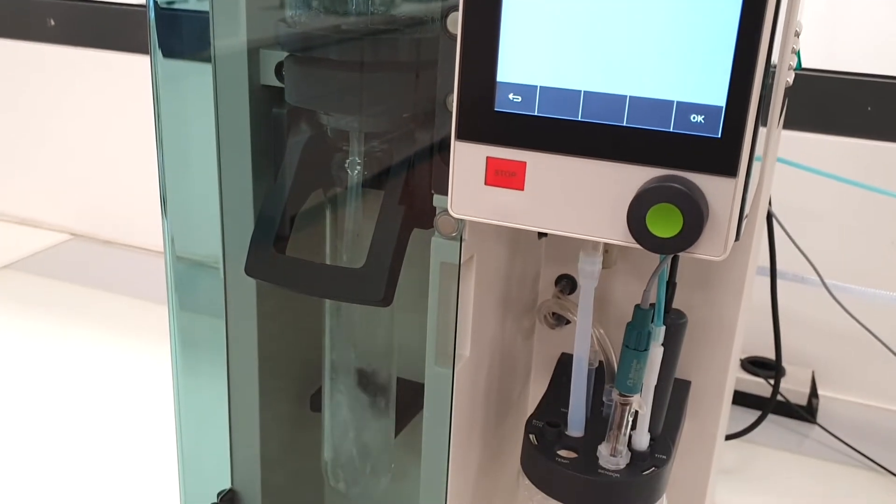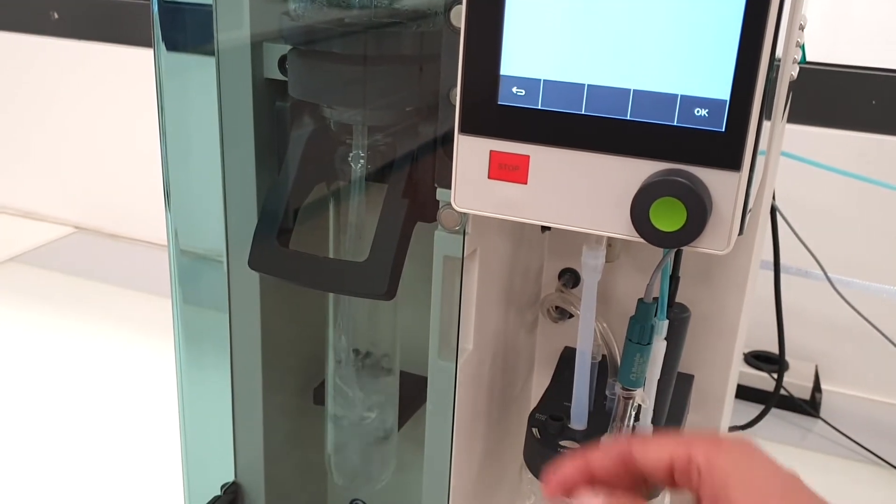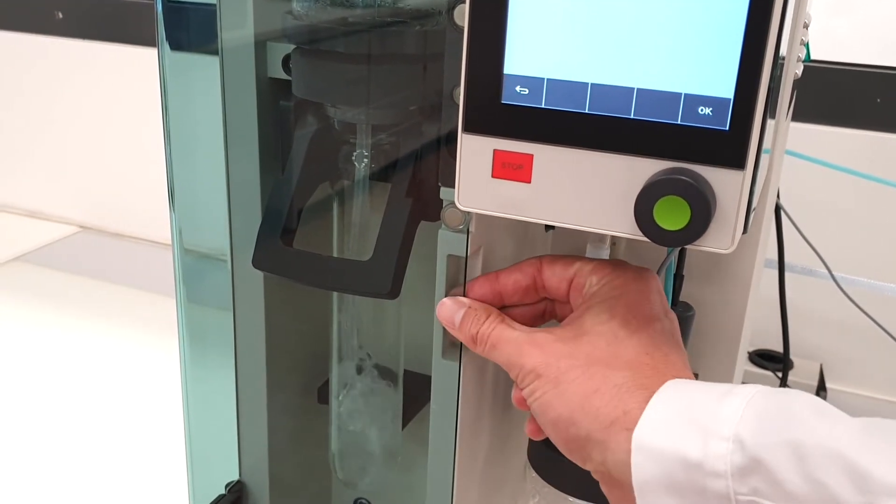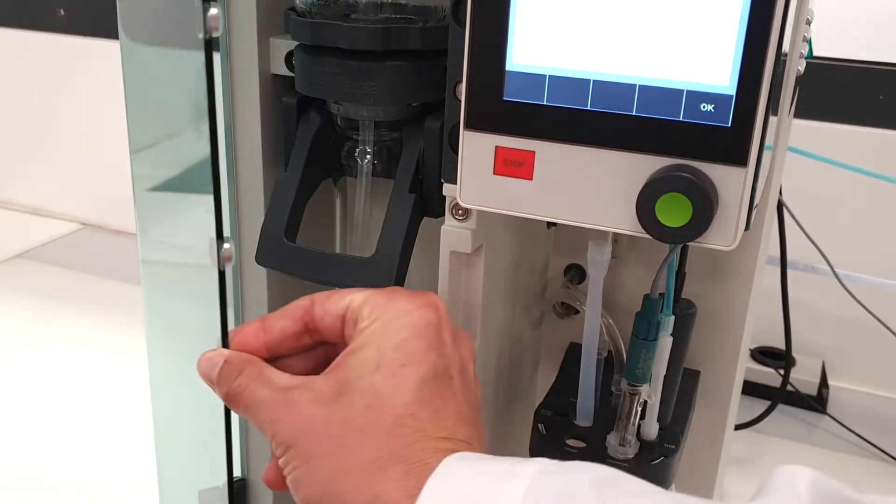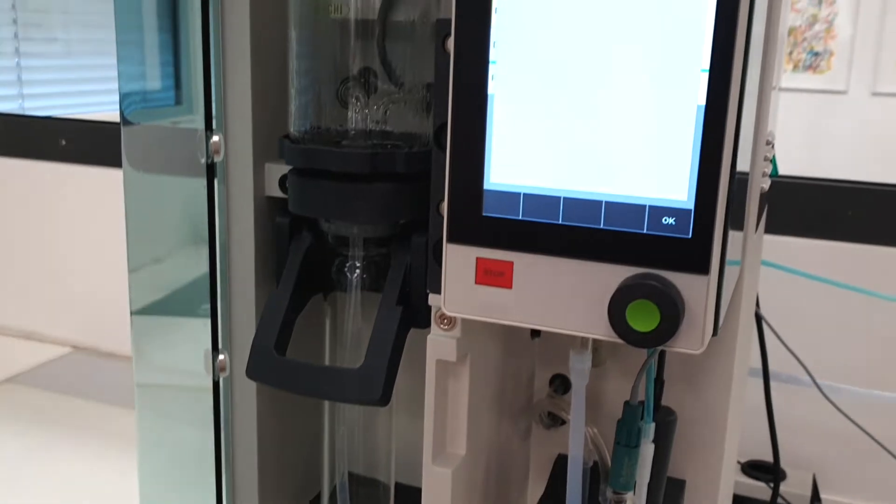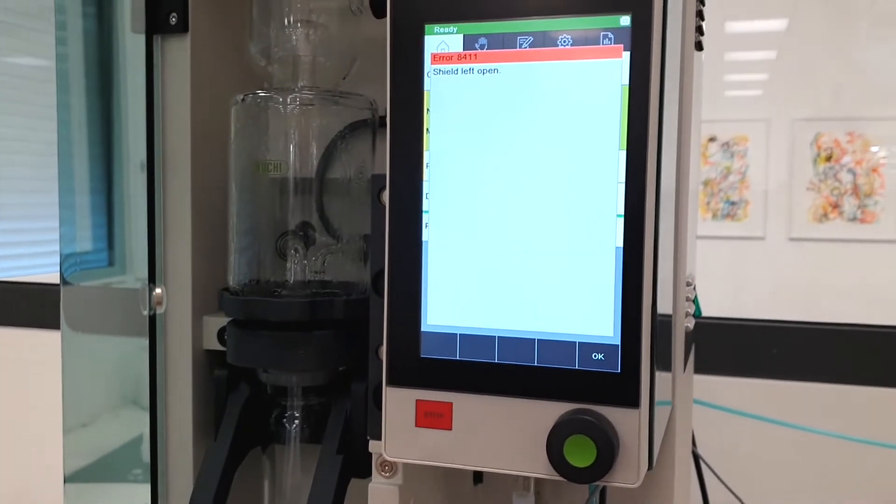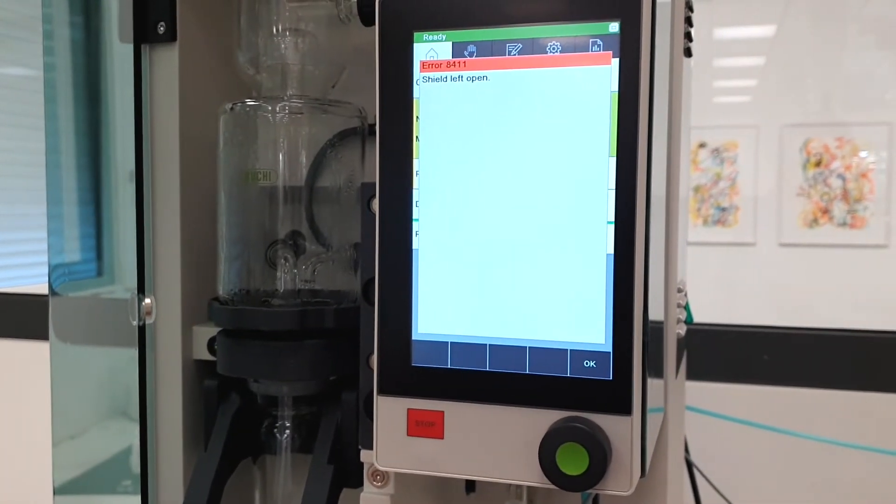If you open the distillation door during a determination, the instrument will recognize it and stop the determination immediately.